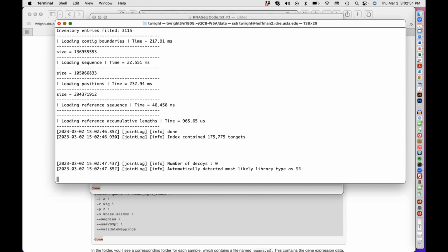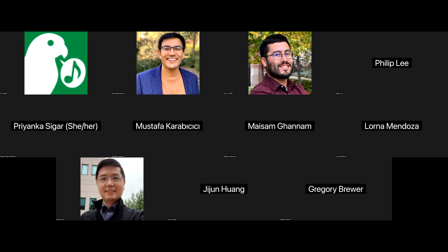Okay, all right, thank you. So it should take about 10 to 15 minutes to run. I'll catch up eventually. I'll just watch you guys do the rest, and we're moving on to the R.